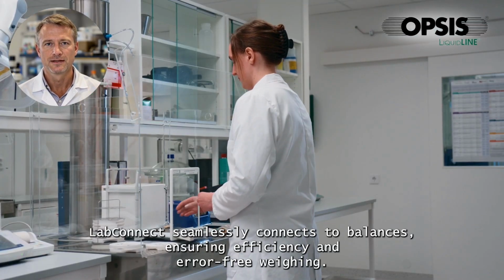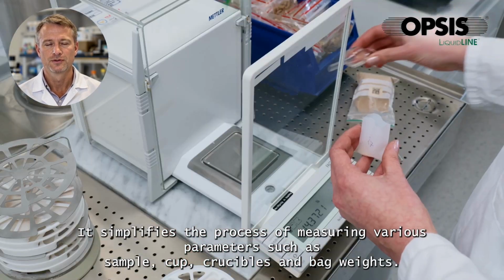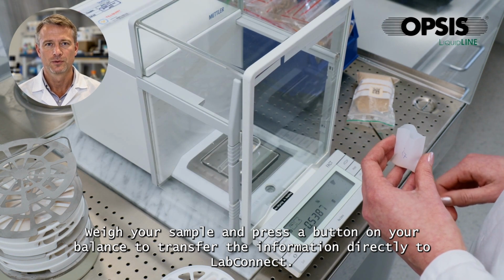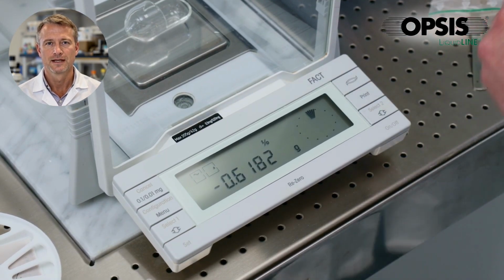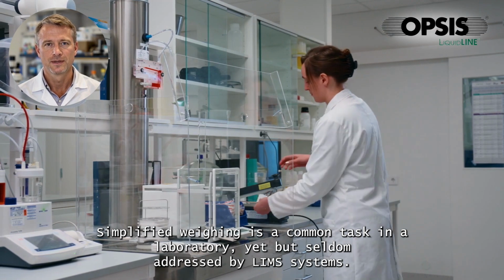LabConnect seamlessly connects to balances, ensuring efficiency and error-free weighing. It simplifies the process of measuring various parameters such as sample, cup, crucible, and bag weights. Weigh your sample and press a button on your balance to transfer the information directly to LabConnect. Simplified weighing is a common task in a laboratory, yet seldom addressed by LIMS systems.